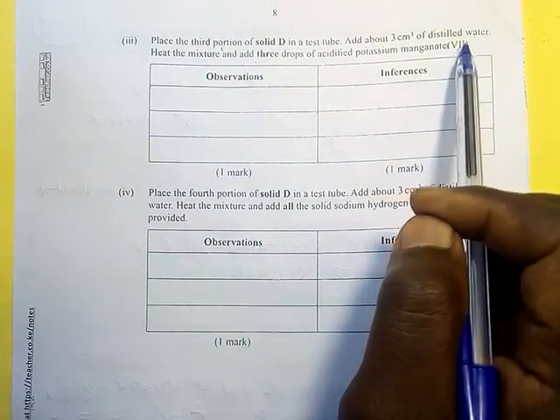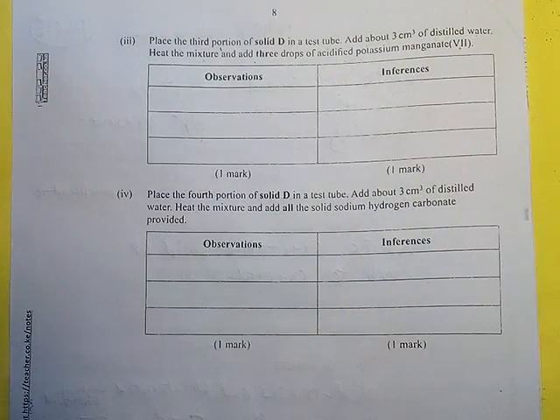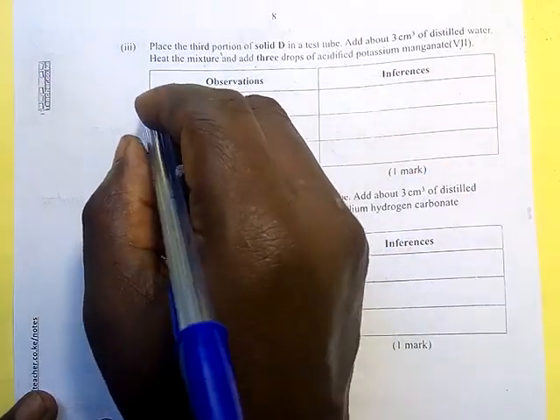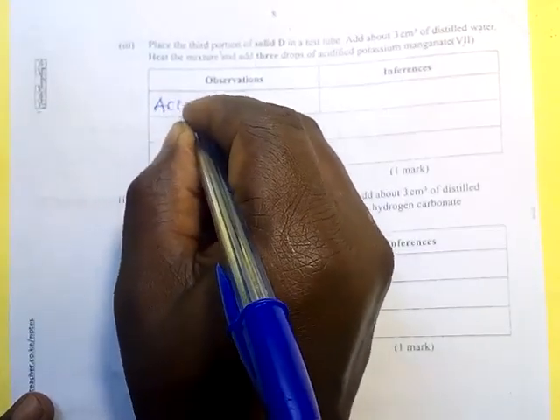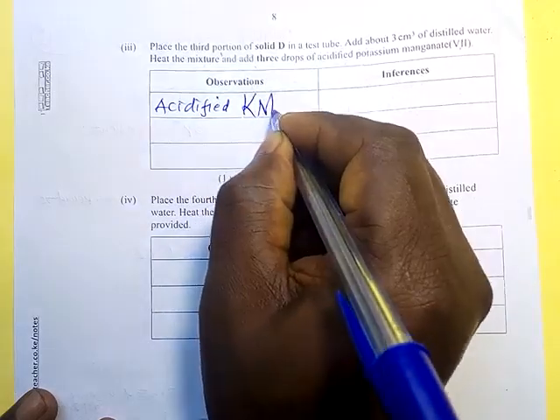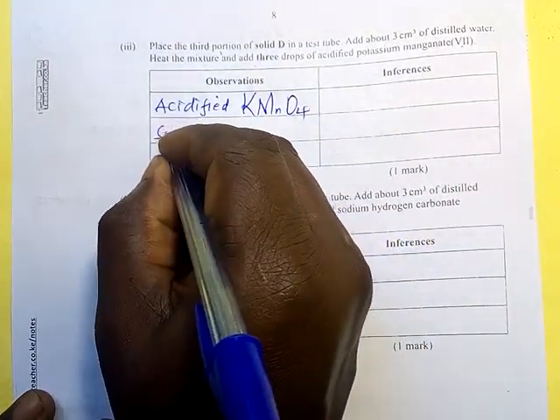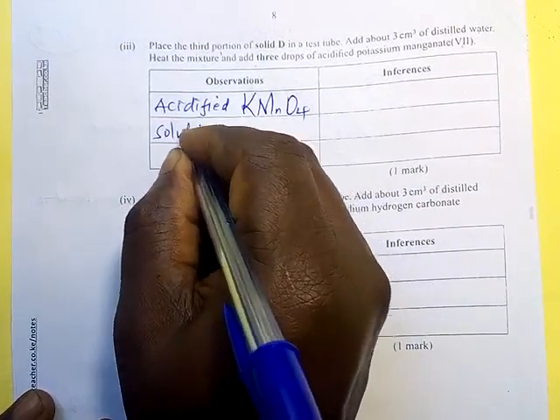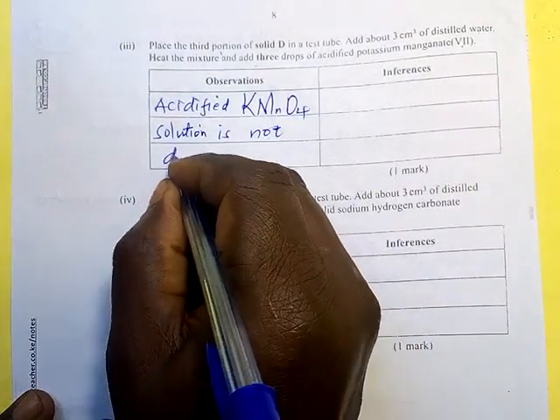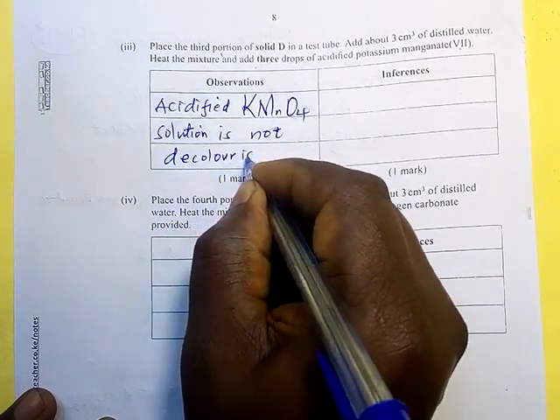Then the observation is that the acidified potassium permanganate solution is not decolorized.